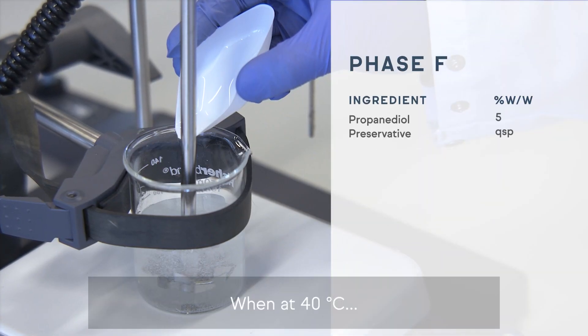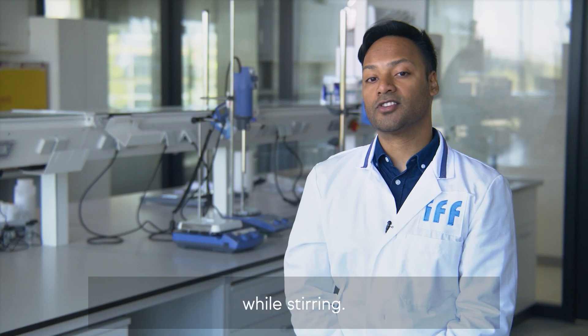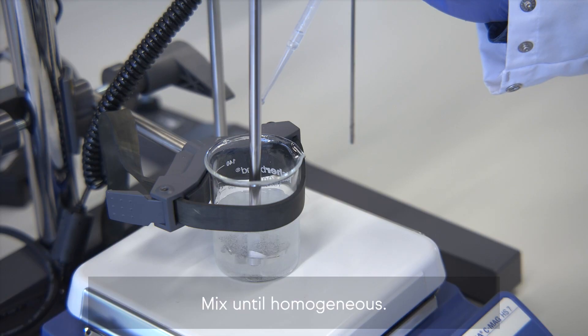When at 40 degrees Celsius, add the ingredients of Phase F — propanediol and the preservative — while stirring. Mix until homogeneous.